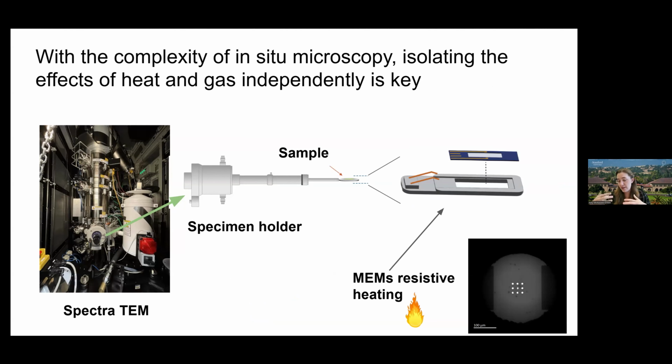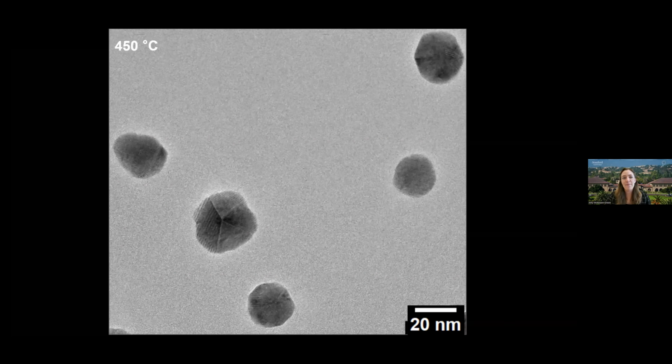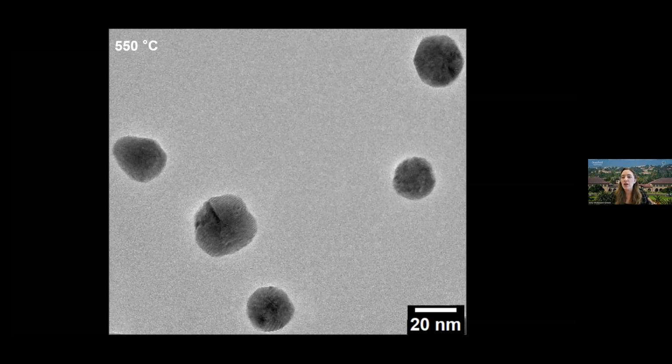Our heating work started off in vacuum, where we ramped the system from 0 to 750 degrees C, taking snapshots at intermediate temperatures. To kick it off with a data set, these are 5 example gold ruthenium particles that are polycrystalline and homogeneous, which means the gold and ruthenium are nicely intermixed. This may or may not be foreshadowing.